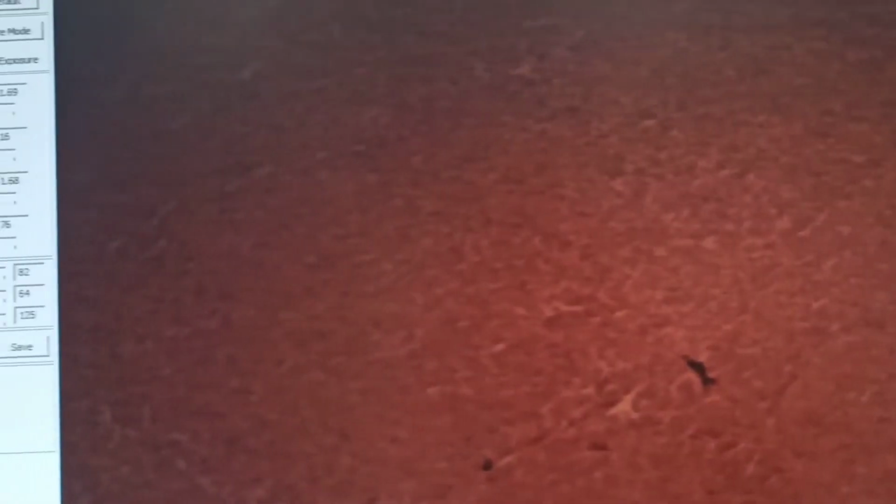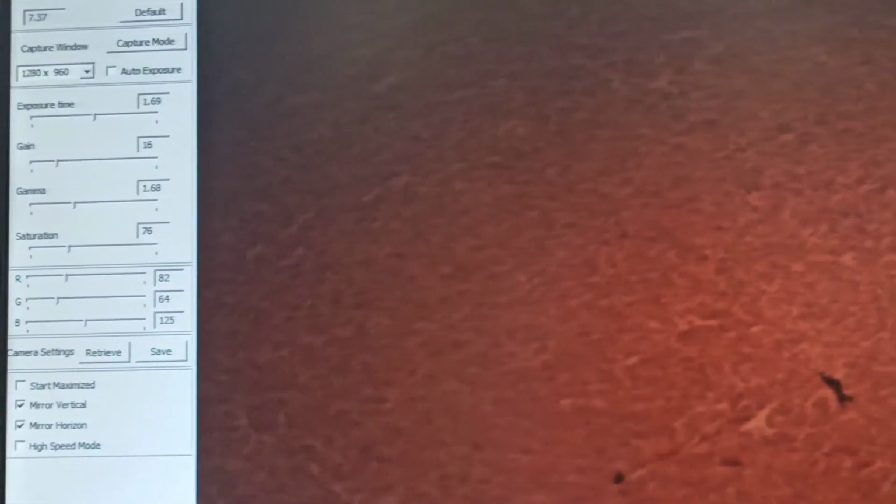Okay. In adenohypophysis, we have two kinds of cells actually. Do you know? Chromophils. Yes, exactly.